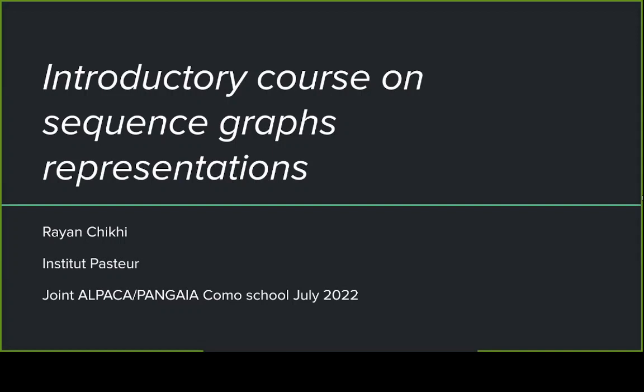Great. So welcome to a pan-genomic introduction on construction and visualization of pan-genome graphs. We'll see a few different graphs, and the lecture will be somewhat interactive in the sense that I will be running the tools on small examples. Feel free to interrupt me at any time, raise your hand, ask a question, and I'm happy to be interrupted.